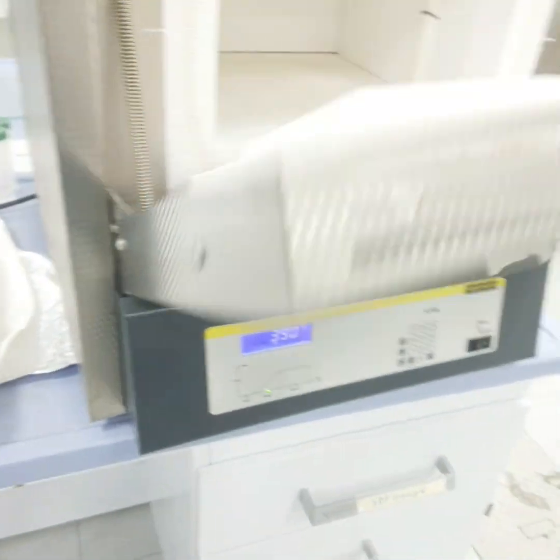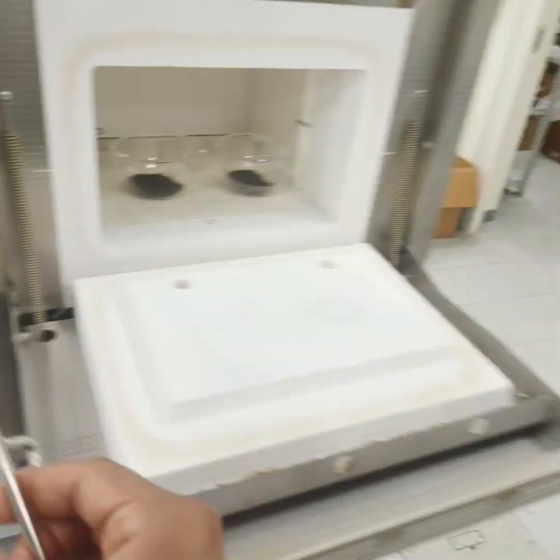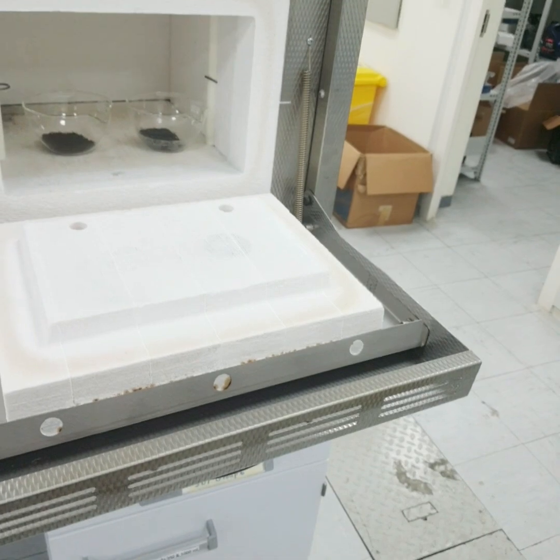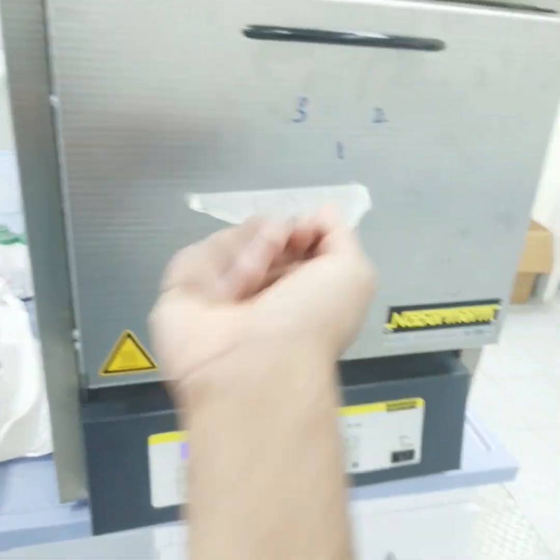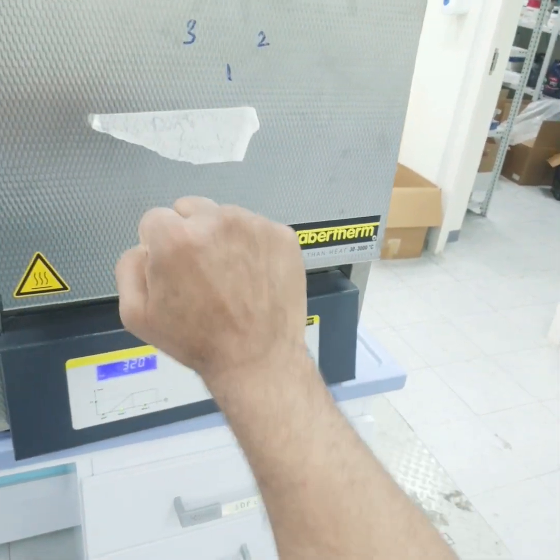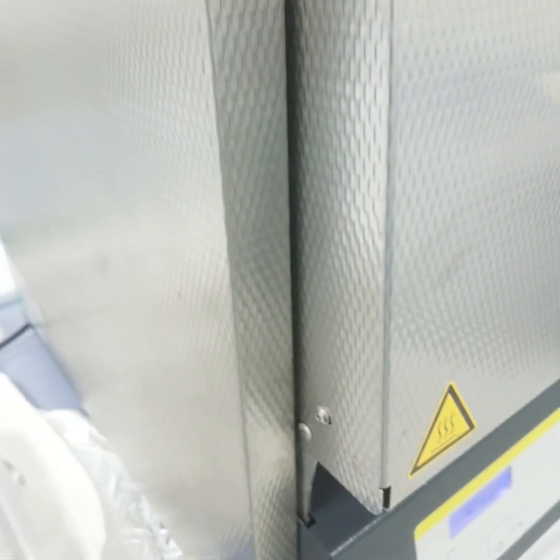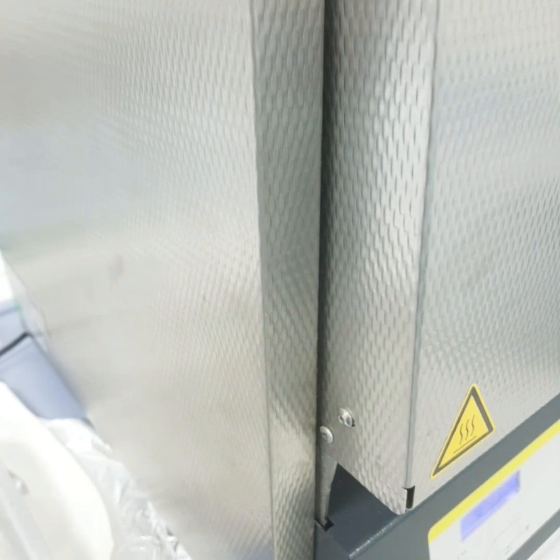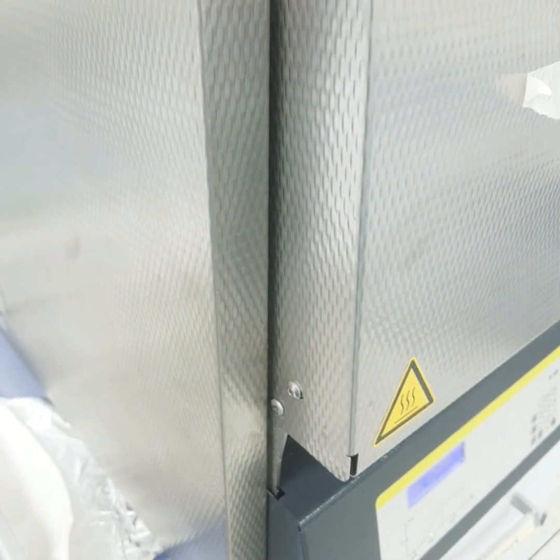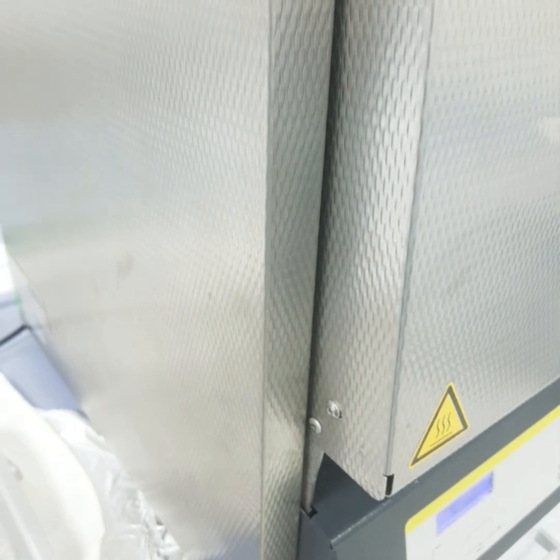Now we place our sample inside the electrical muffle furnace. I have used these tongs to put my samples in, and you should also take special precautions, like wearing thermal gloves so that you are not exposed to high temperatures, because the temperature here is very high, around 600. Here the sample will be charred, with initial expulsion of smoke, because we are heating at 600 degrees C, and all the organics will also be burnt.